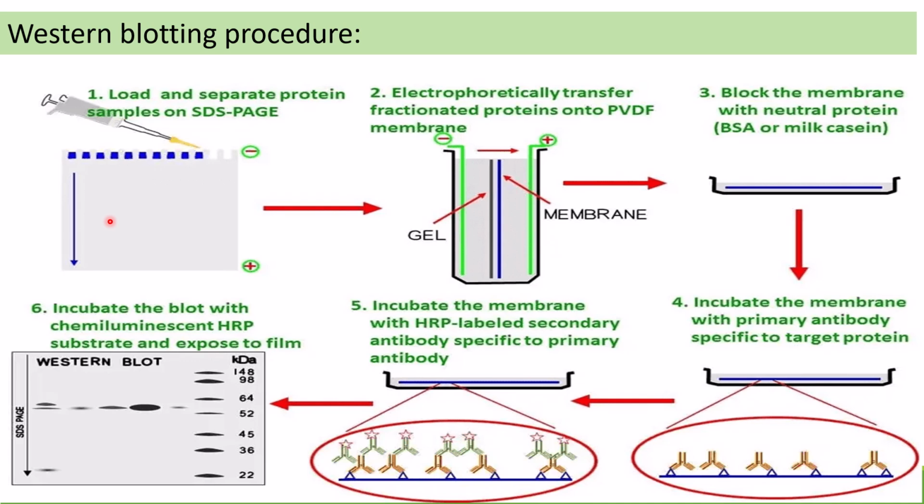On applying electricity, on the basis of the molecular weight, the proteins will be separated. That you have to remember. So those with the smaller molecular weight will be residing here. Those with the higher molecular weight will stay on the upper side of the gel.